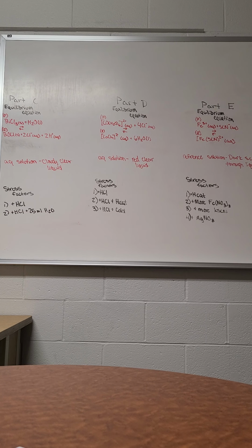It was not see-through. In the last stress factor, KSCN and AgNO3 were added, and that turned into a cloudy, milky white liquid that was not see-through.